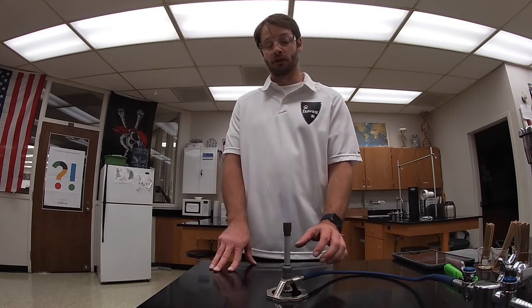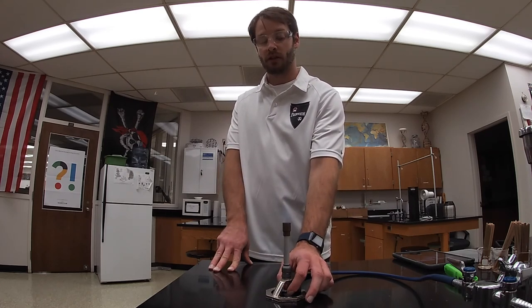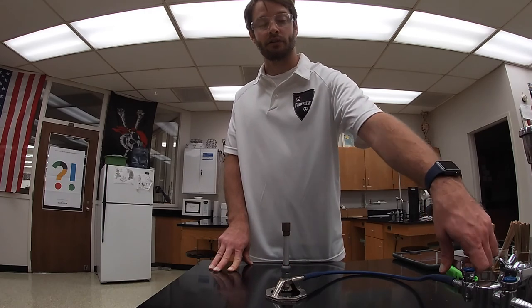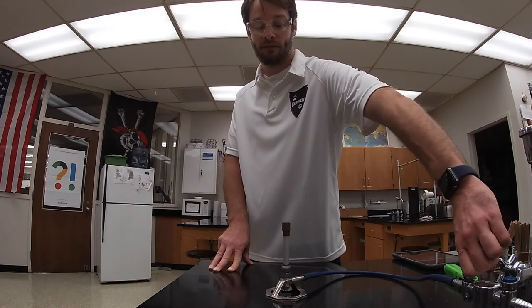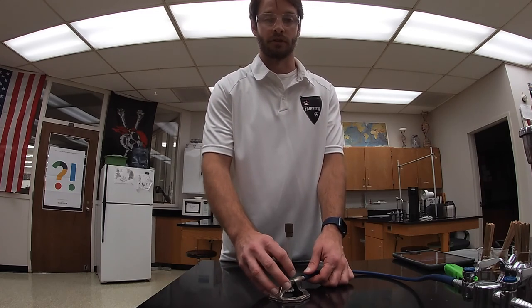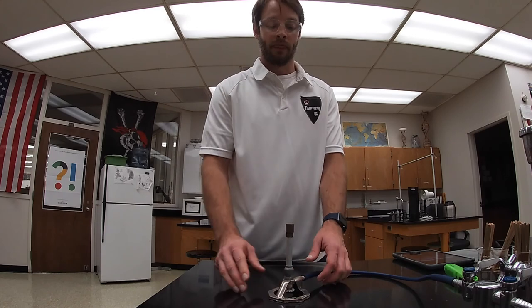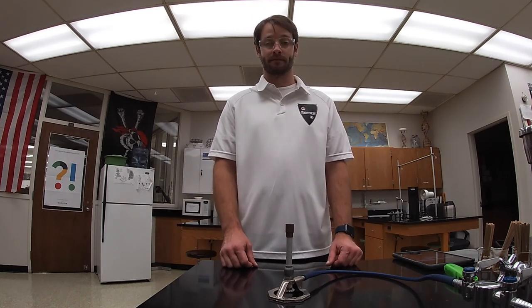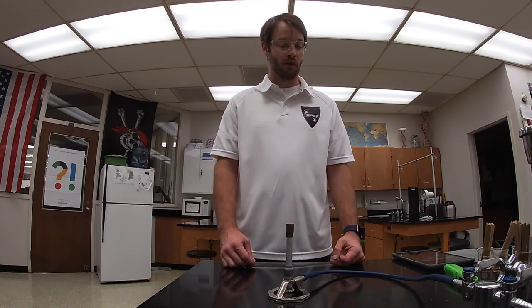To extinguish the flame, shut off the gas source at the bottom by turning the valve, then shut off the gas at the jet, and close the chimney to reset it to its original position. The very tip of the burner is made of brass and will stay hot for quite some time. Hot brass looks the same as cold brass, so it's important that you never touch the tip of a Bunsen burner because you don't know how recently it has been lit.